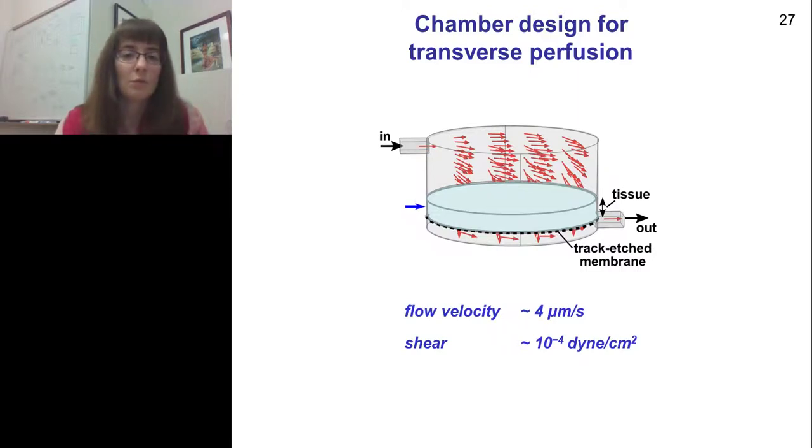And Sangjo found that by placing an inlet on the upper left and an outlet on the lower right, he was able to drive fluid flow pretty much straight down through that tissue so that he could pick up anything that was being secreted and carry it out. Other designs where the inlets were both on the same side or both on the top or both on the bottom really didn't provide this flow through.